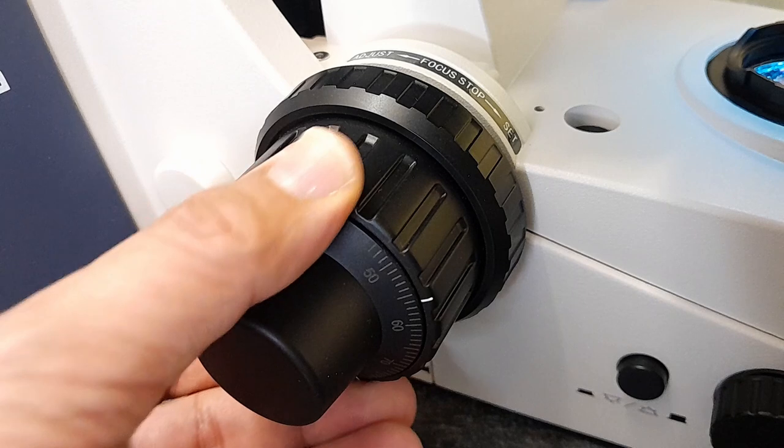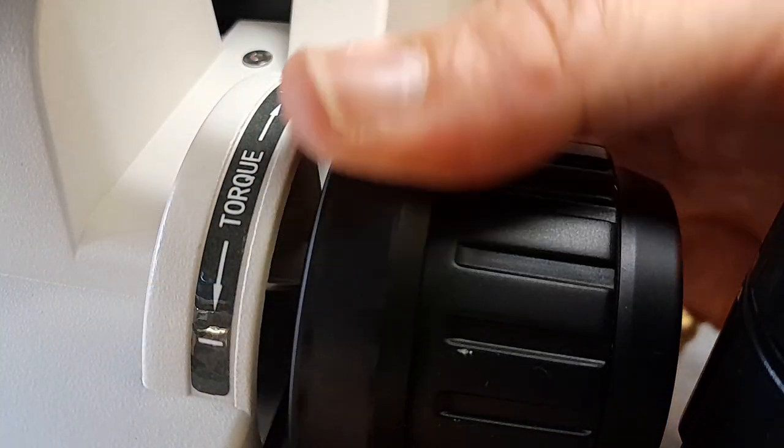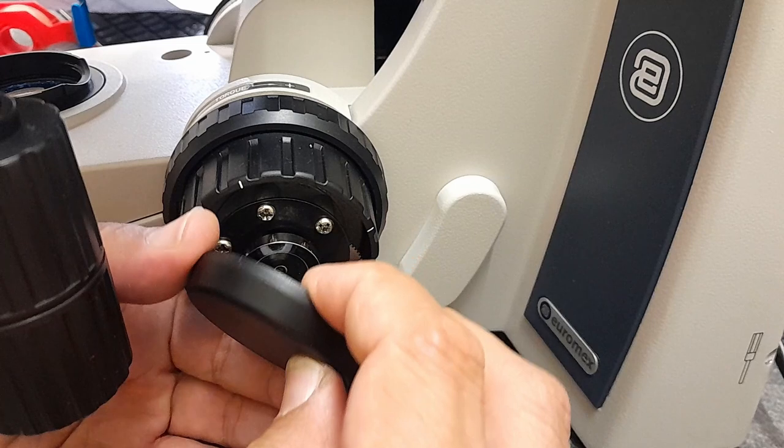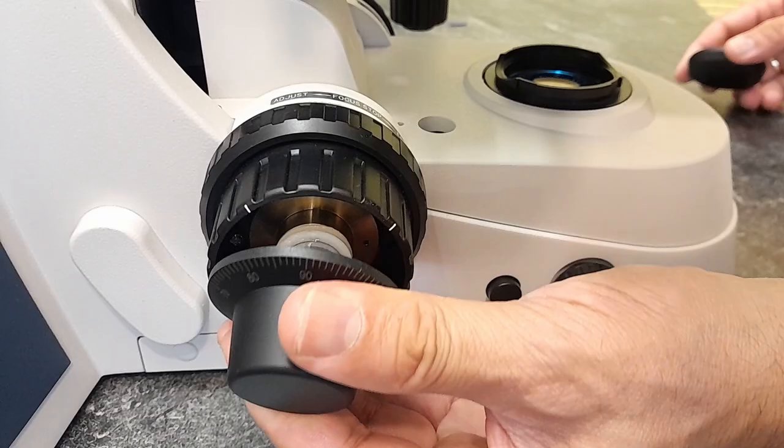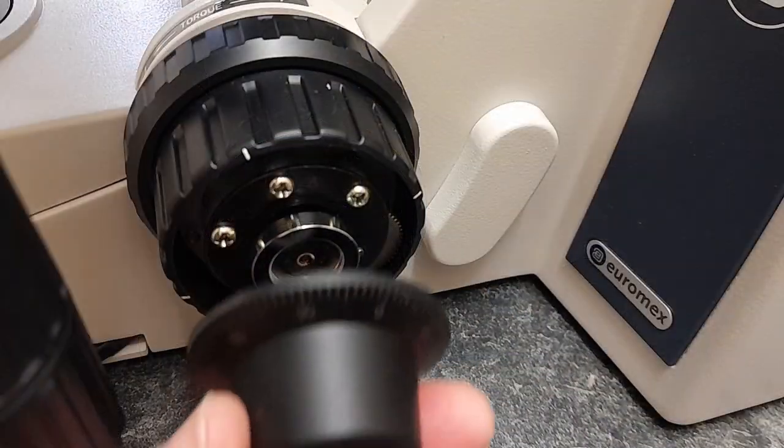So let's talk about some standard features first. Those features that can be found on, I would say, pretty much any microscope these days. I would like to mention them just for the sake of completion. Of course, the Delphi X observer microscope has a coarse and a fine focus knob. Pretty much every microscope these days must have those. The tension of the coarse focus knob can also be adjusted. There is a tension adjustment ring that you can turn. It is also possible to adjust the fine focus knobs depending on whether you're right or left handed. It's possible to detach the handle for the fine focus knob because it is connected over a strong magnet and therefore reversing it is easily possible.